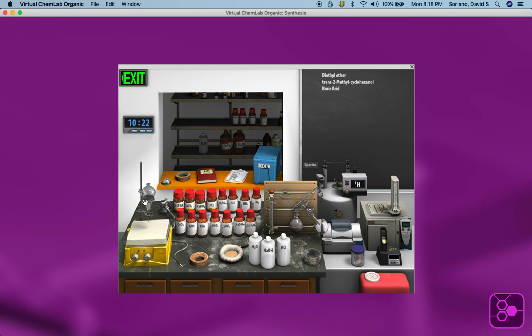Then what you have in there right now are the product mixture. Now let's put in aqueous base. The top layer is the target molecule, trans-2-methylcyclohexanol, and solvent. The lower layer is boric acid and water. Because it's a volatile solvent, we're going to rotovap it.